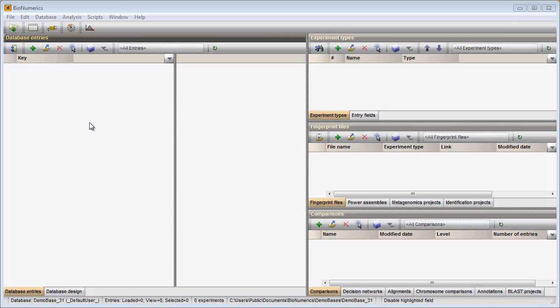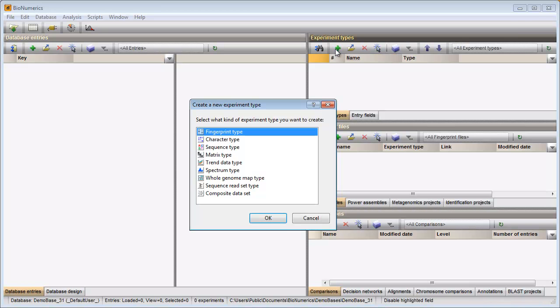In my database, no character type experiment has been defined yet. To create an experiment type, I press this button in the Experiments panel. I select character type from the list and press OK.